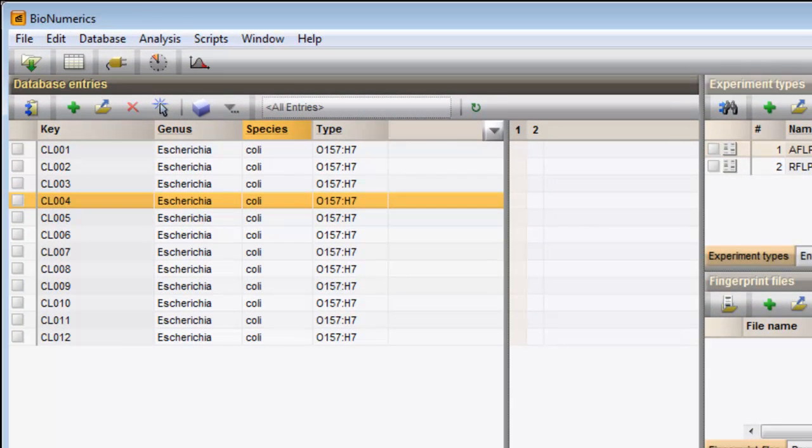In the Database Entries panel, each row corresponds to a database entry. In this database, 12 entries are present.